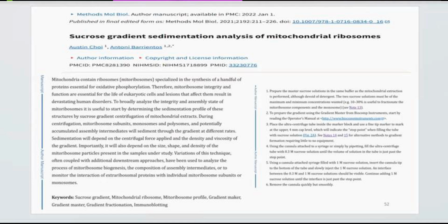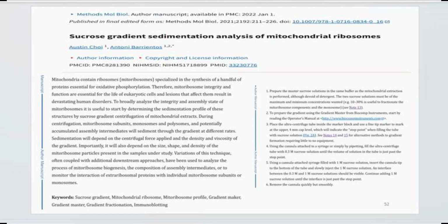Disconnected somehow. Yes. So if you are talking about higher purity, then you have to talk about enrichment. Maintaining the structure of the molecule is also very important, because ionic materials can affect the structure of the material under study. Osmotic environment is very important. So sucrose, cesium chloride, all these things are going to affect the biological activity or structure of the particle or subcellular organelle under study. So you have to be very careful in selecting and using the gradient.